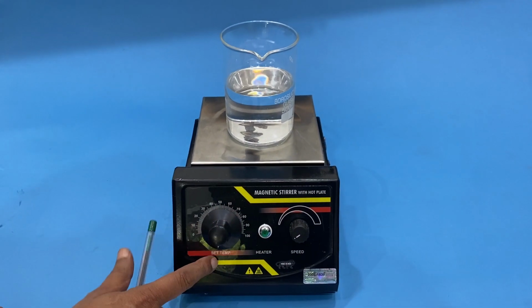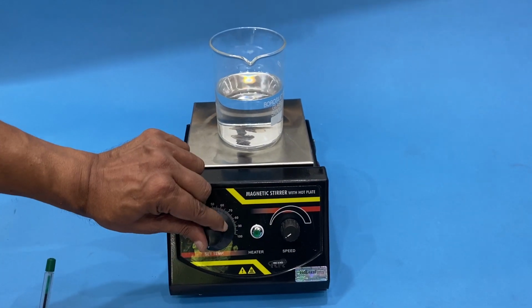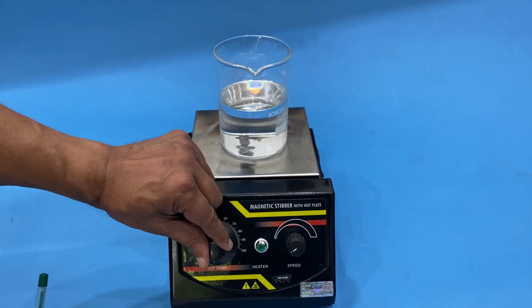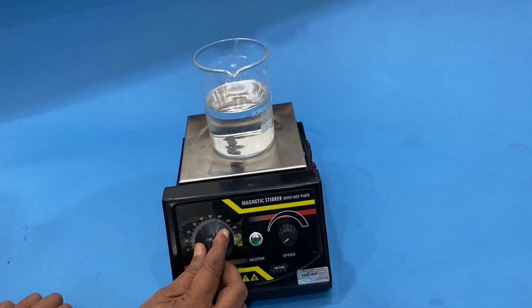If you keep it on below, it stops. Just listen to the click. Come close and see. Yes, it clicks. And then if you keep it on 0 to 30, it is slow heating.